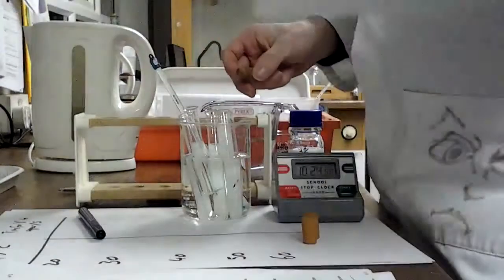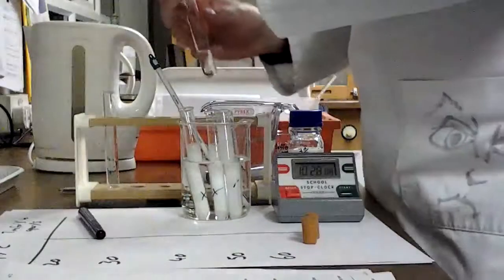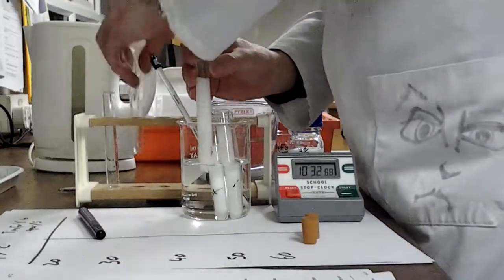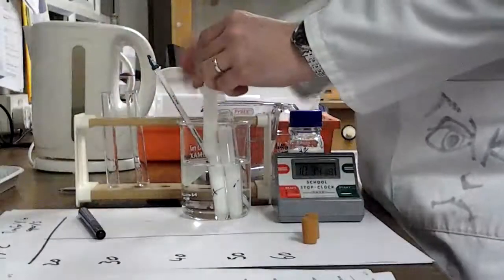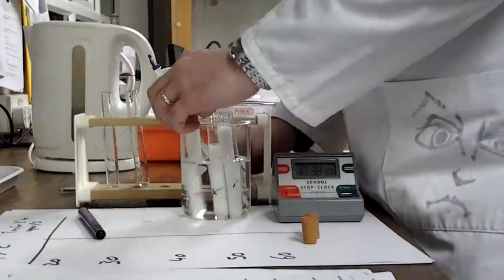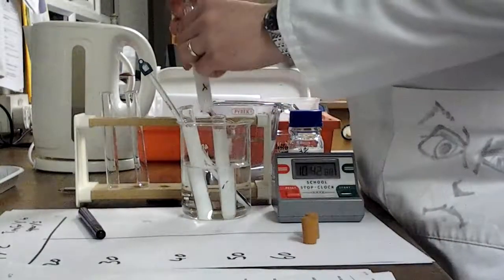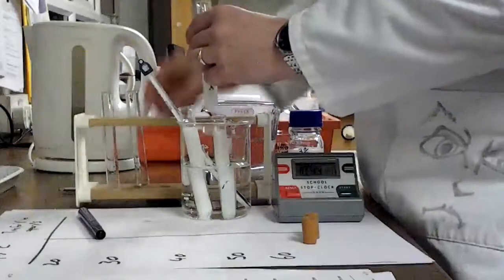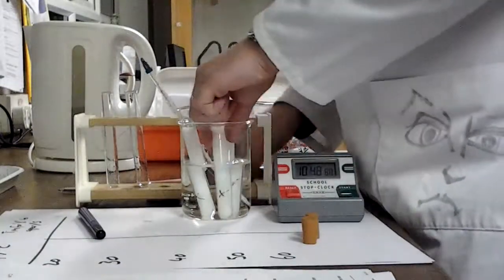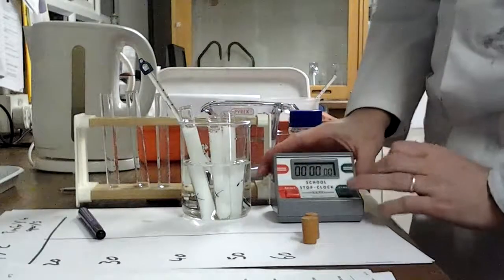Okay, this tube, now empty, let's put it back in there. And I'm going to do the same with all of my 3 setups. So in goes the enzyme on that one. Give it a quick mix. And the reason why I'm doing this as speedily and as efficiently as possible is because we are going to start the timer when all 3 are going. In it goes. Okay. So we've inverted, we've given them all a good mix, and now I'm going to start the timer.